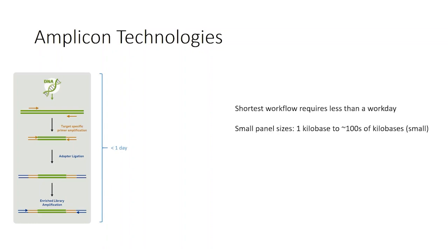In general, they're targeting small panel sizes, so this could be a kilobase to hundreds of kilobases, so not quite as broad as, let's say, hybridization-based capture. And then the enrichment performance is good, but not on par with hybridization capture technologies.